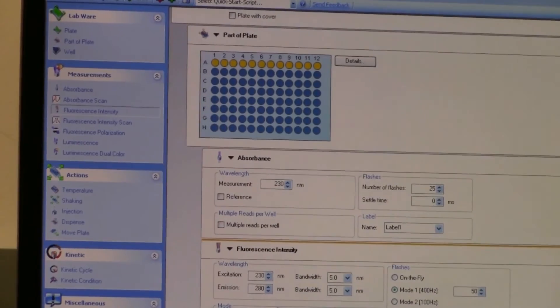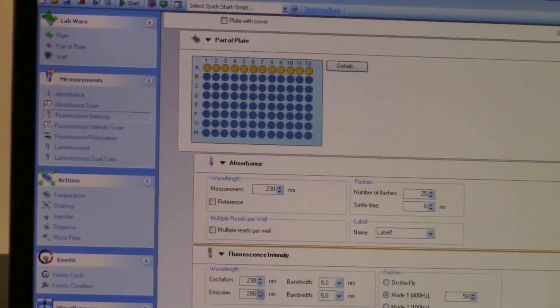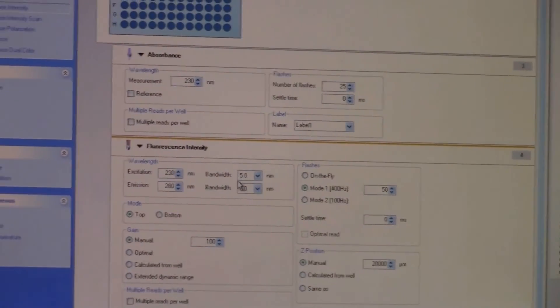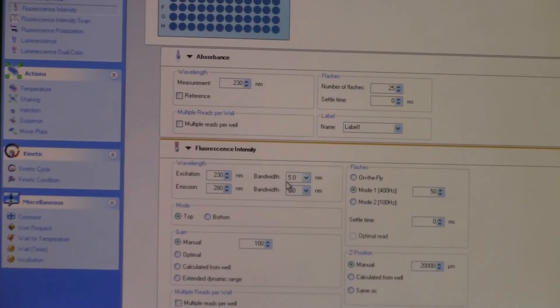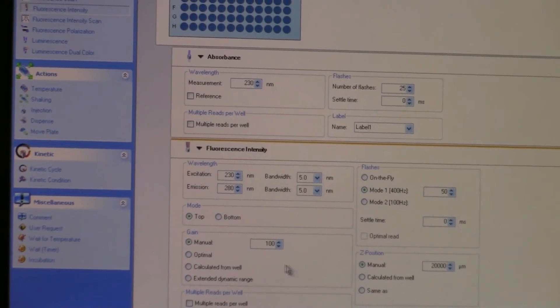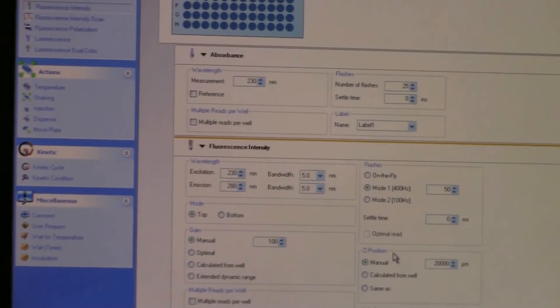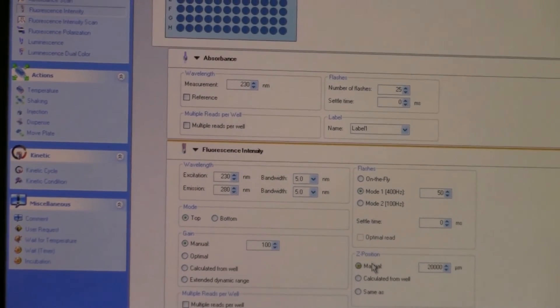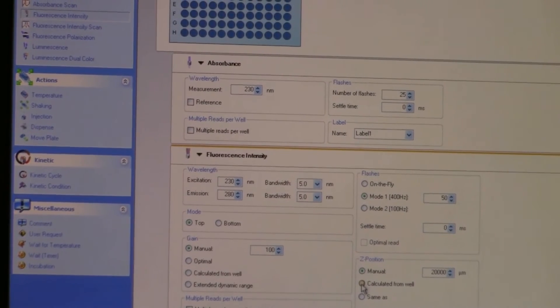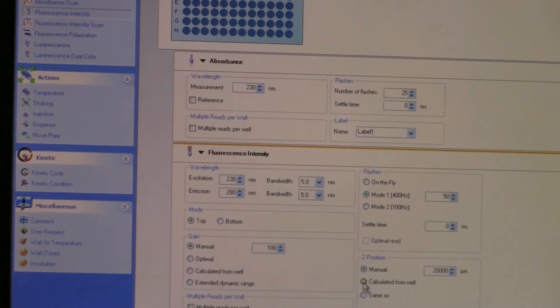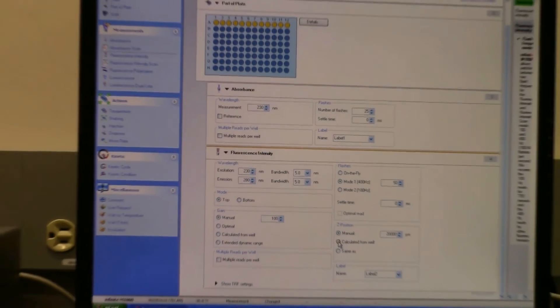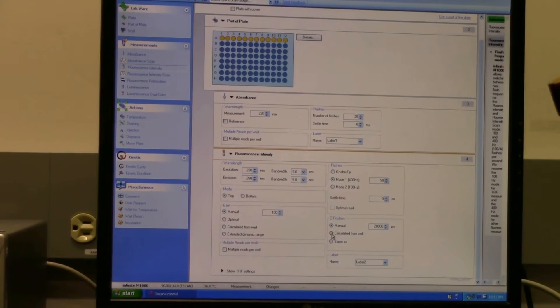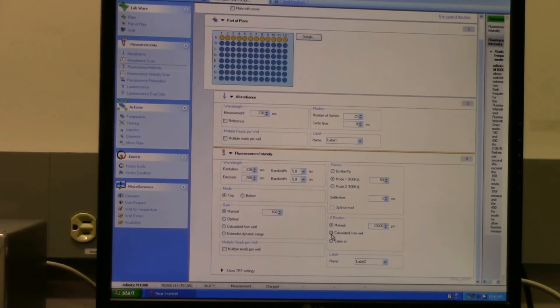Normally what you would do for fluorescence intensity is usually you know your excitation and emission, and bandwidth is usually something you know. What I would recommend for Z position is that you actually ask the instrument to calculate it from the well so that it can get the optimum Z position for you.